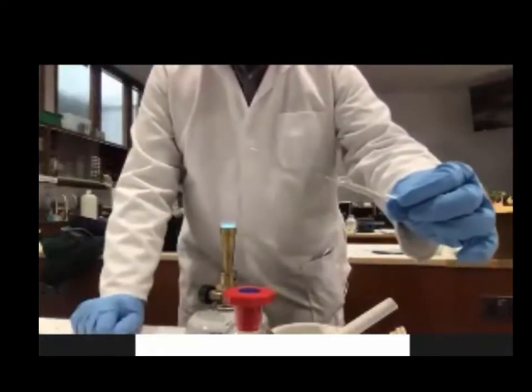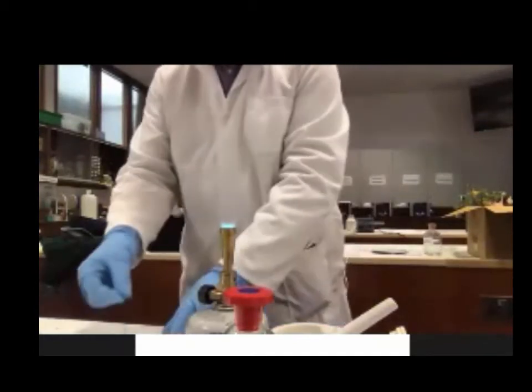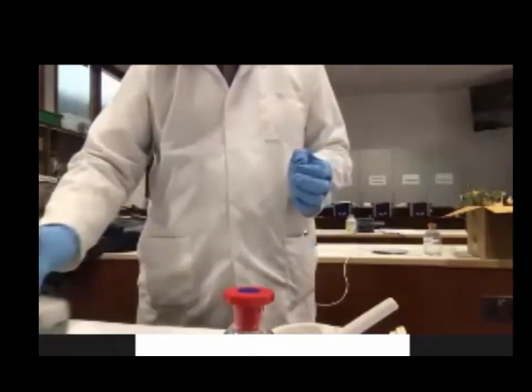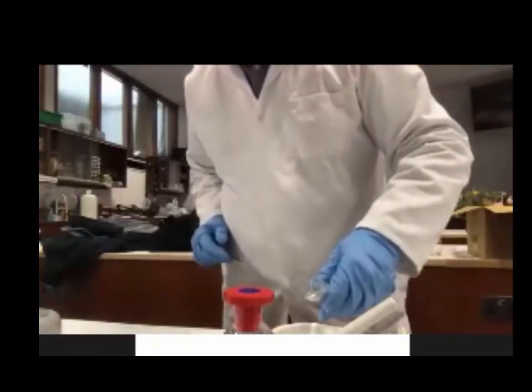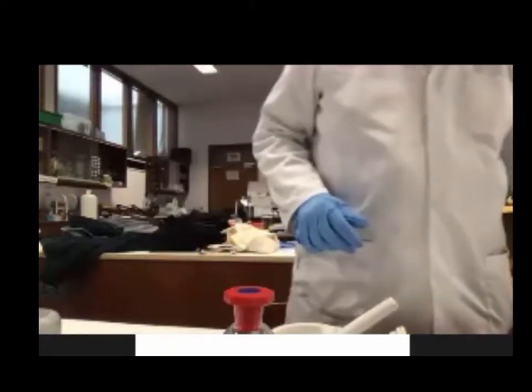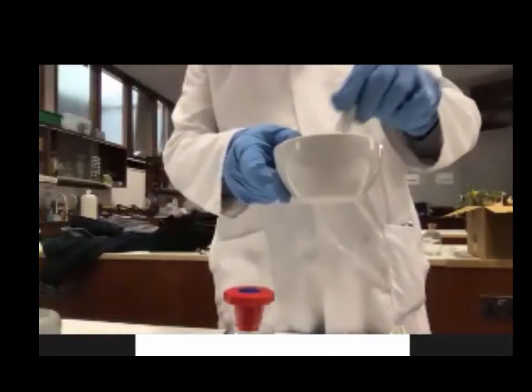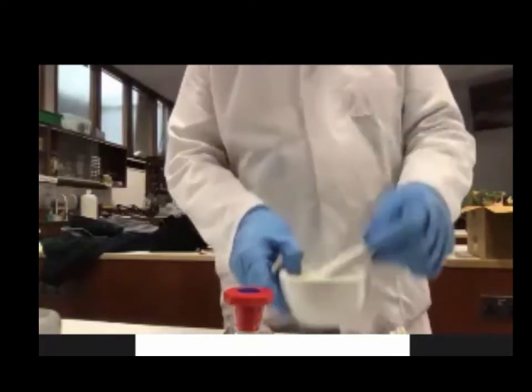Now, if you aren't watching, you won't see it. So you pull out the Pasteur pipette and you break it. Yeah, that'll do. You just break it off, and that gives you your dropper. Okay. I'm going to use some of the solvent in the mortar and pestle just to agitate up the pigment. Okay. There's our piece of paper.